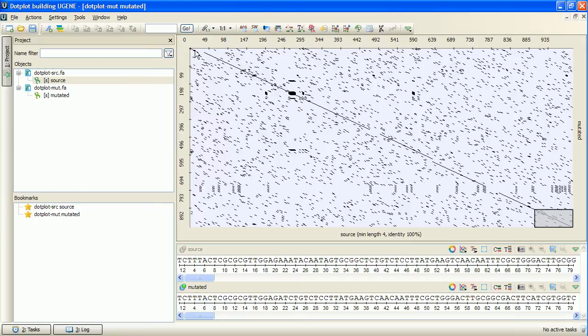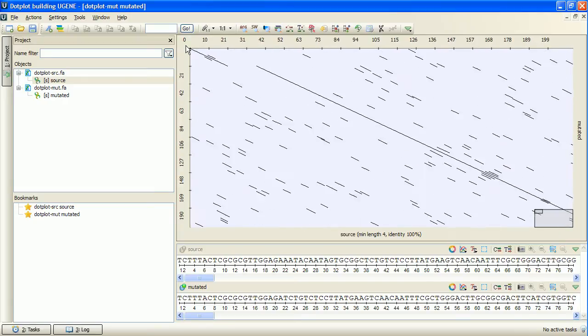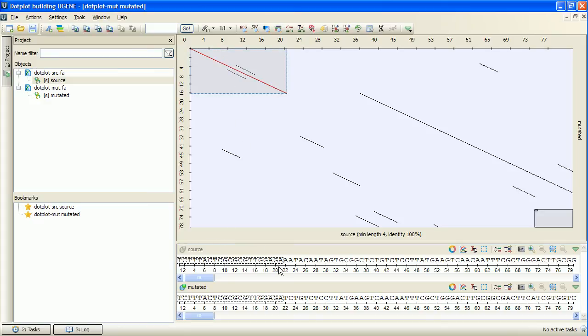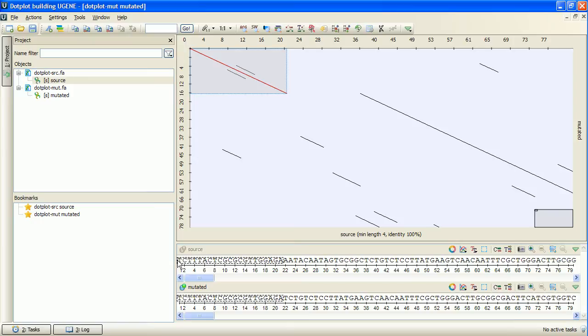I will zoom in the first matching region by pointing the mouse cursor near it and rotating the mouse wheel. Then I select the region's area by simply clicking on the line. Note that the corresponding selections were automatically made on all the connected sequence views. Now, looking at the details view, we can see that the sequences match along the selected area.